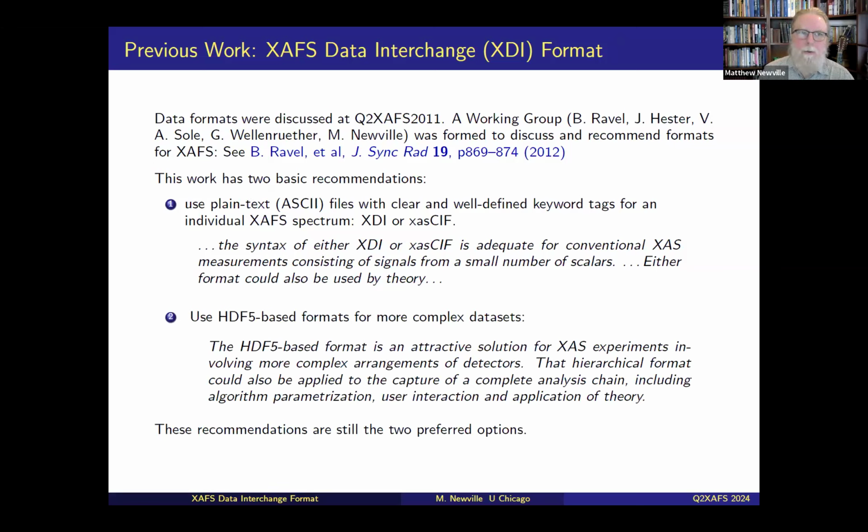But that only describes a single spectrum. And so more complex data sets, including handling multiple spectra measured at the same data run or even at the same time. The recommendation at the time was to work towards using HDF5 because that hierarchical data format can capture complex data sets, and it's widely used in synchrotrons. And I'll come back to this.